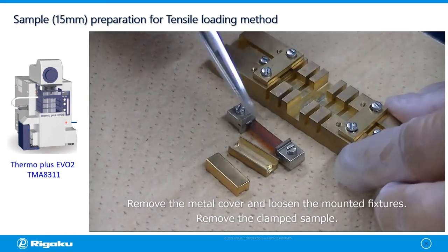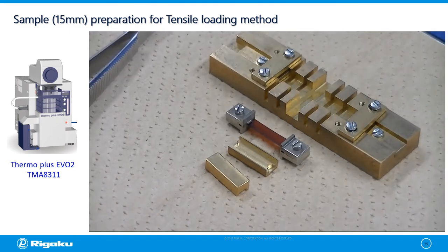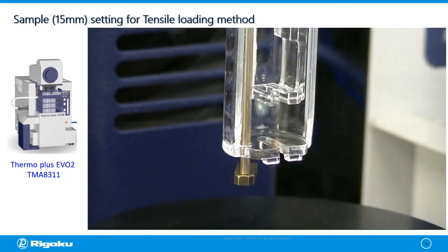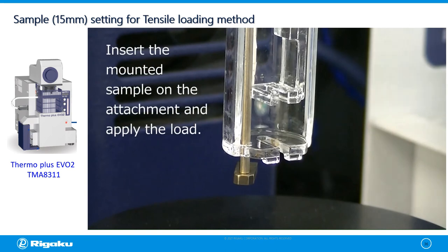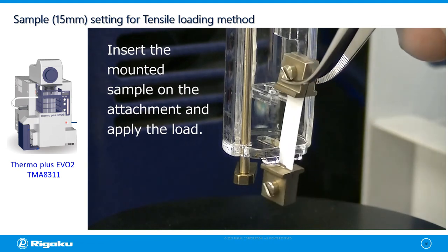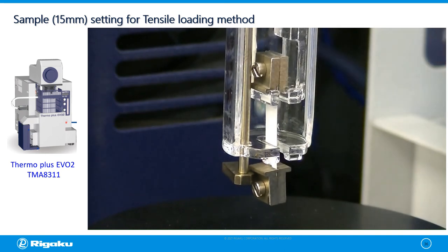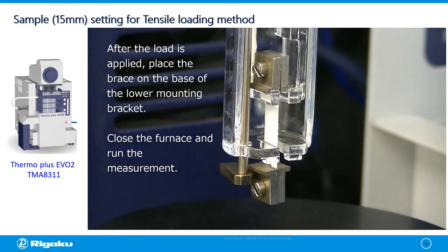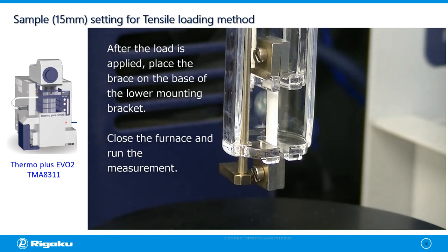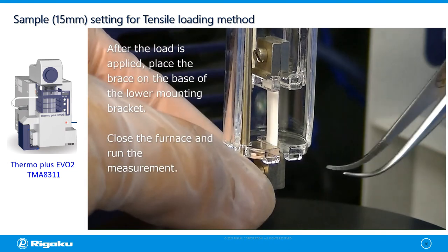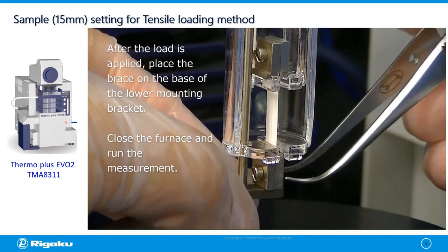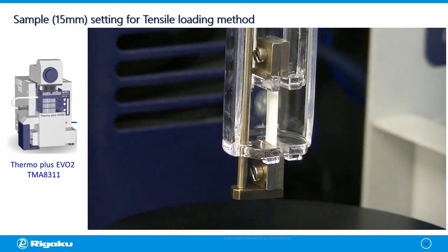Insert the mounted sample on the attachment and close the furnace to run your measurement.